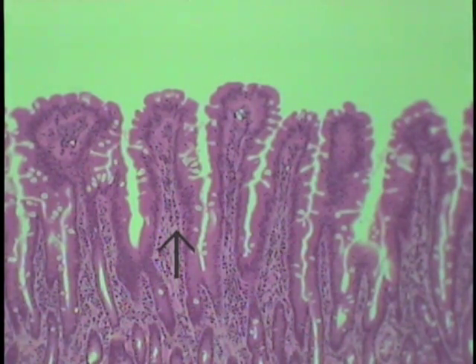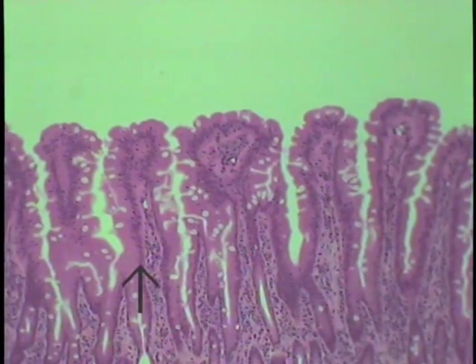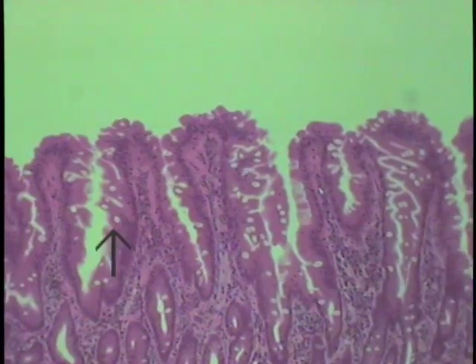A very quick observation of the intestinal epithelium covering the villi will show a few scattered goblet cells, as indicated by the pointer, and can be seen with this scanning or low-powered objective. So when one examines the intestinal epithelium, goblet cells are present, and one can set a number in one's memory that they're sort of scattered along and not an extraordinarily prominent feature. So if one moves the field, one can get a feel for the number of goblet cells present in this duodenal mucosa or lining epithelium just by concentrating on the goblet cells alone. This is indeed the duodenal section.